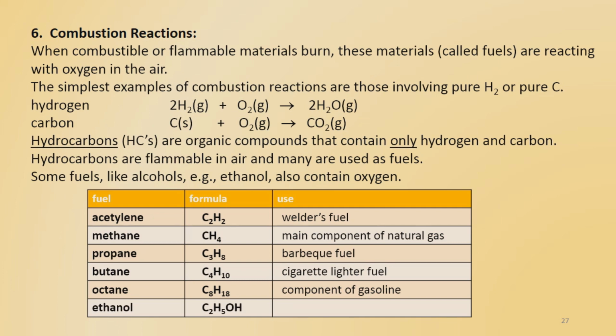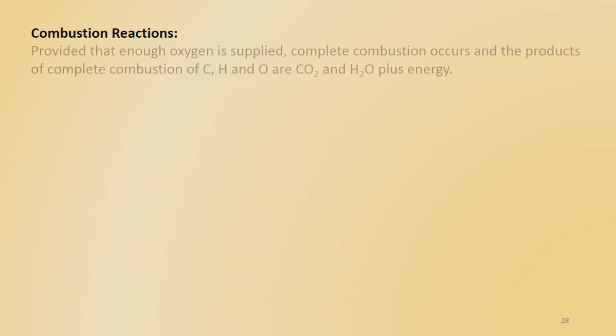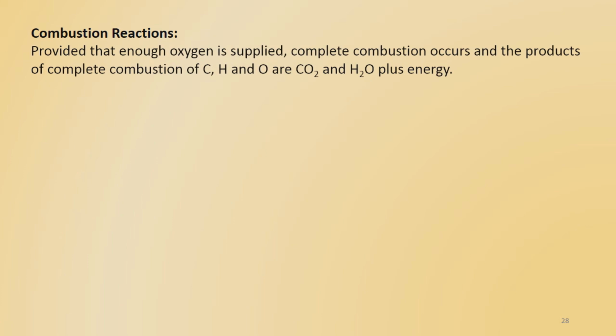Here's an alcohol. Ethanol, C2H5OH, is both a fuel itself and a gasoline additive. Well, provided that enough oxygen is supplied, complete combustion occurs, and the products of complete combustion of carbon, hydrogen, and oxygen are carbon dioxide and water plus energy.